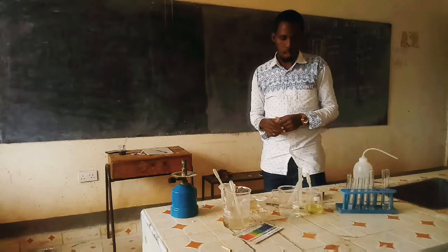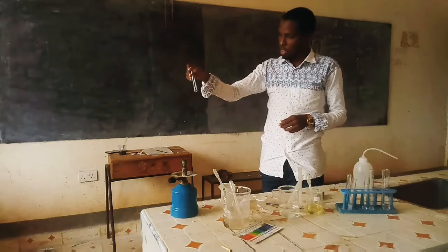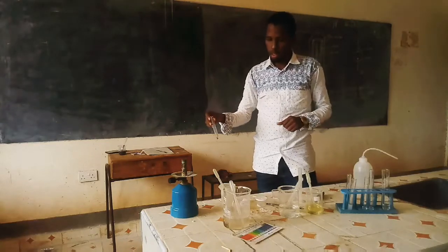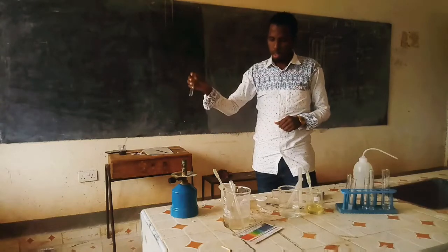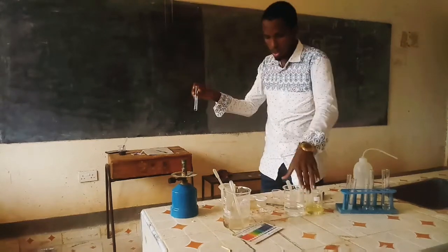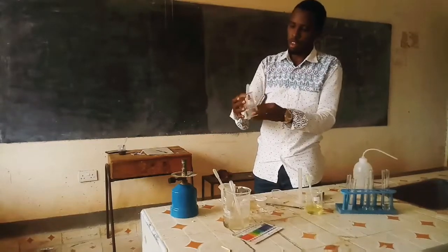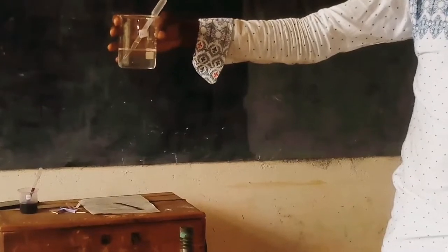Very good. Now, to the second portion, add 3 drops of aqueous sodium chloride.